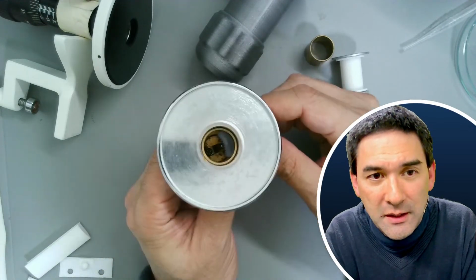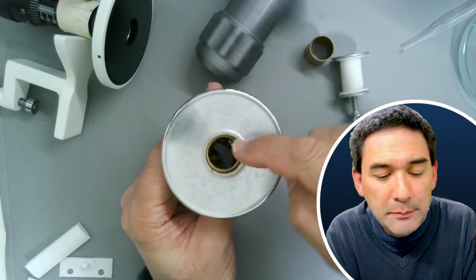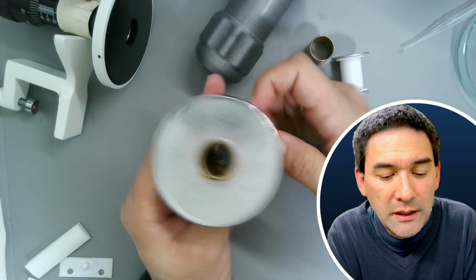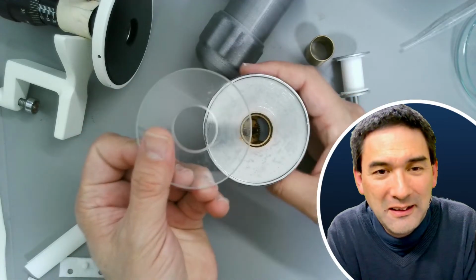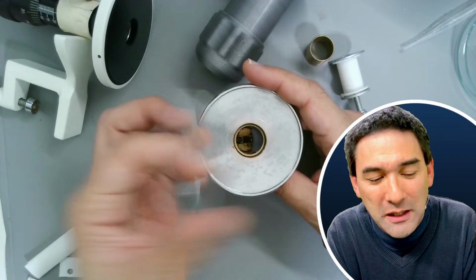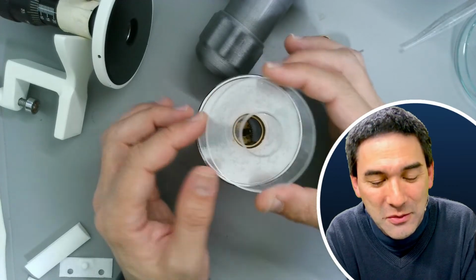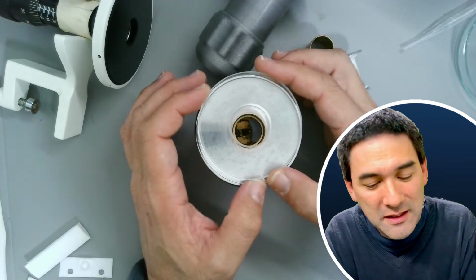And look what happens. When I turn it, you see that the screw goes in and presses this plastic clamp inwards, and then the specimen can be held in place better, right? But I say it's slightly of a lower quality. Look, the glass plate is just in here. So if this breaks, I have a problem, because making something like this is not going to be so easy. But it did come with a spare one. So if it does break, I still have a second one.